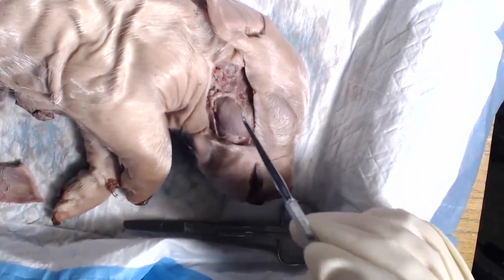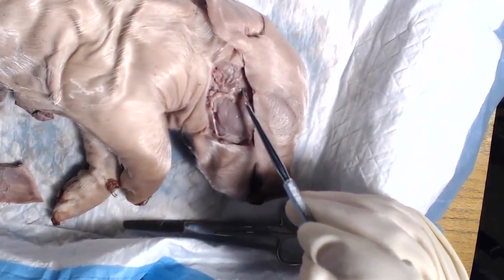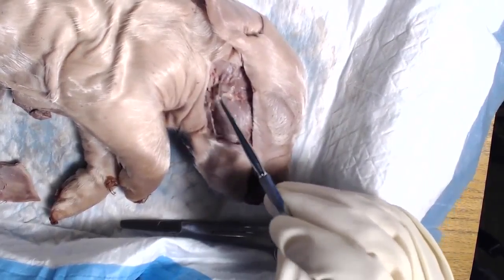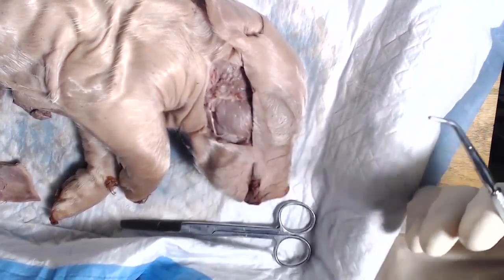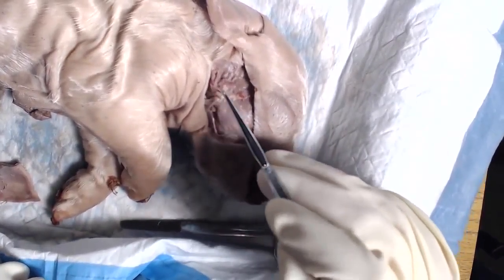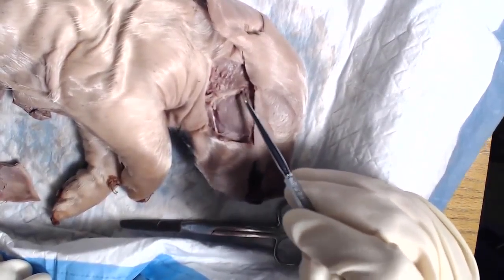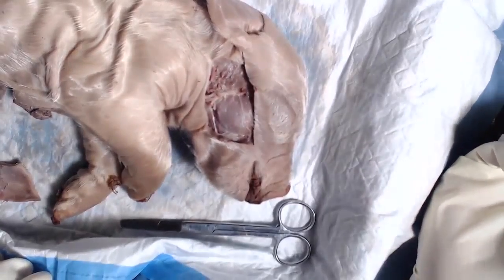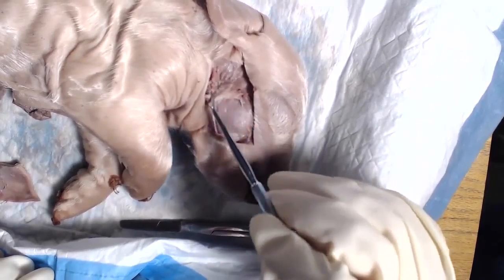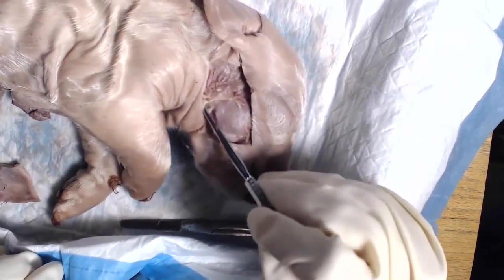Now, if you look just behind your masseter here, you can see this spongy looking tissue. It doesn't have a really distinct shape to it. Some sources I found say it's supposed to be triangular. Maybe you can see that in your pig. If not, that's okay, but you should be able to see this little brown spongy tissue right behind your muscle. And that's the parotid gland. So go ahead and see if you can find that on your pig.